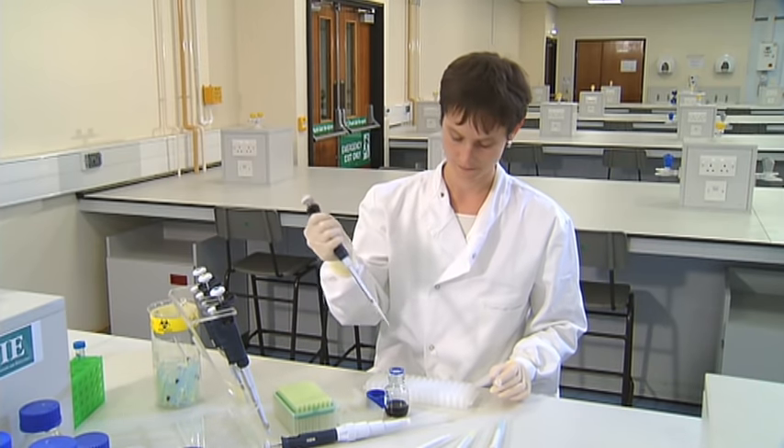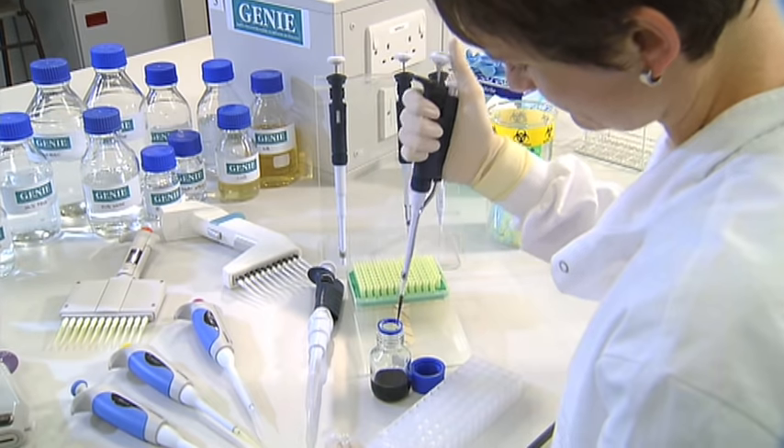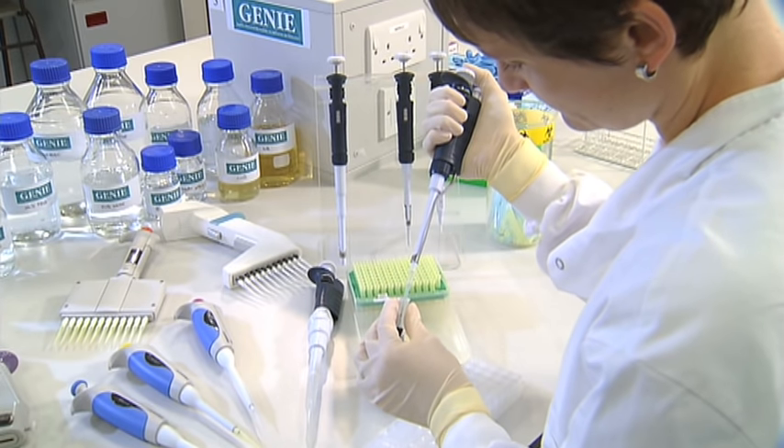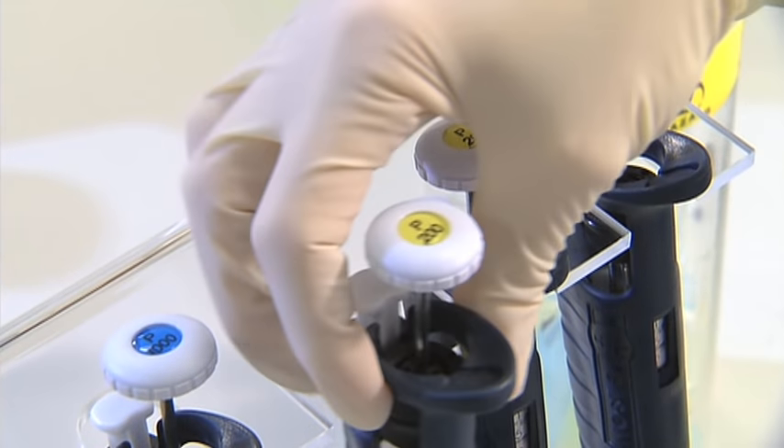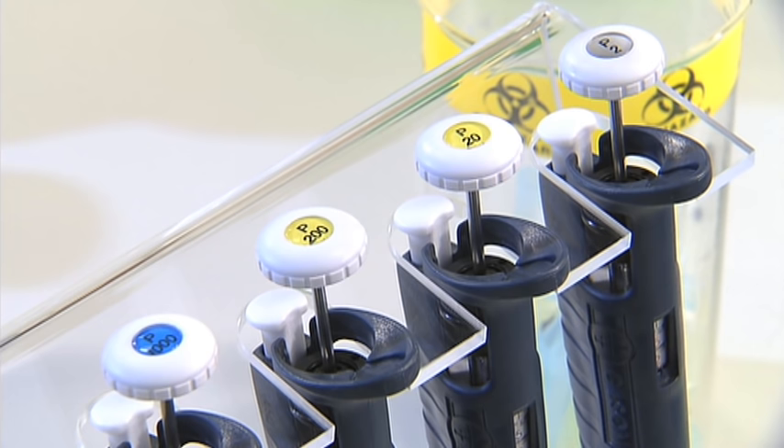Different pipettes work across different ranges of volumes and are named by the maximum volume they pipette. The different pipettes look very similar, so they're labelled on the top of each push button with a capital P, followed by a number which indicates the maximum volume for that particular pipette.